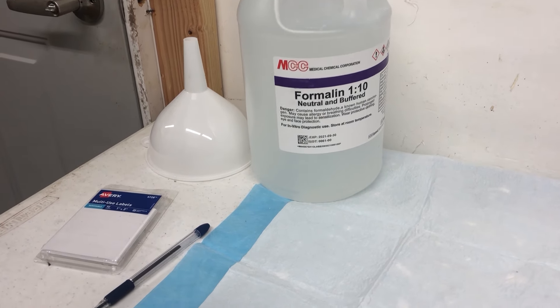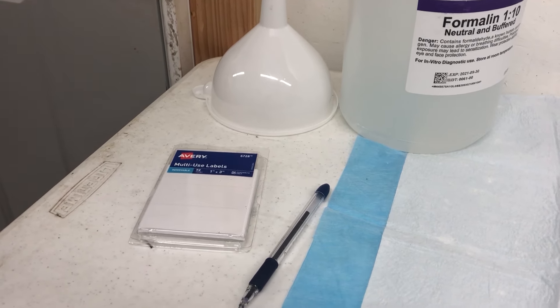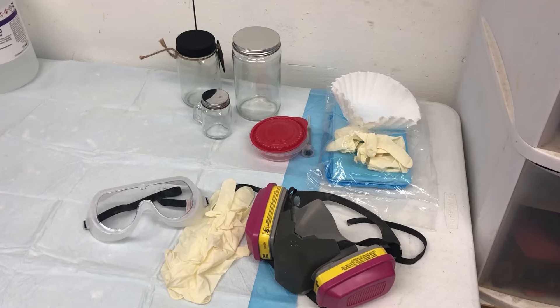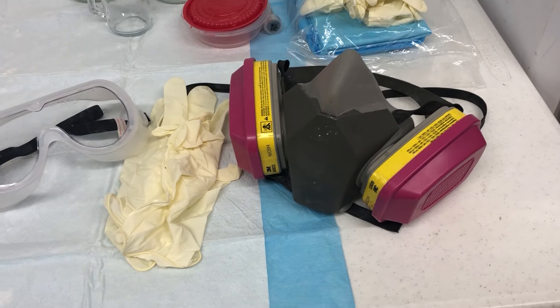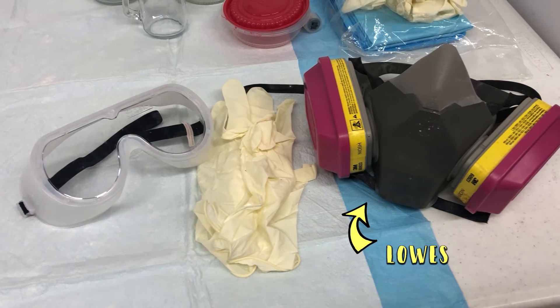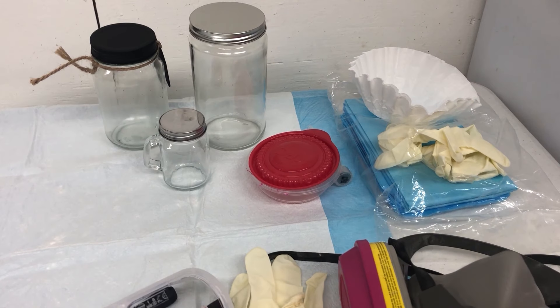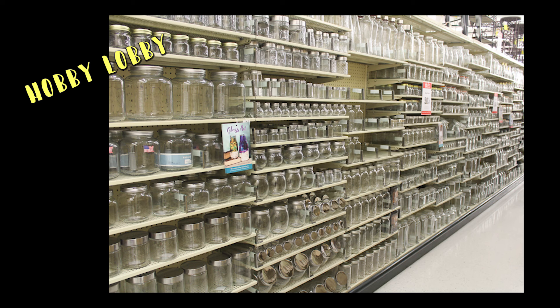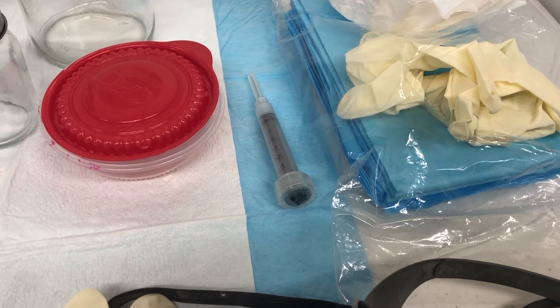For your other supplies, make sure you have a funnel for pouring the formalin, labels in case you need to date them or keep track of the liquid your specimen is sitting in, and a respirator — though you can get away without one if you're in a well-ventilated area. Mine came from Lowe's. You'll also want gloves and goggles, which I got from the Dollar Tree. You'll need a glass jar — it has to be glass because plastic won't hold up to the formalin. Dollar Tree has some great choices but Hobby Lobby has more variety. You'll also need a syringe, and drugstores usually carry them.